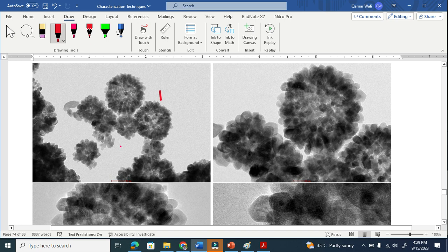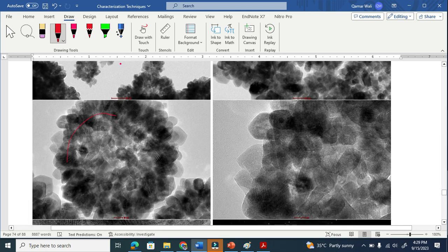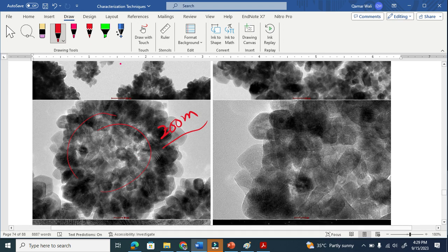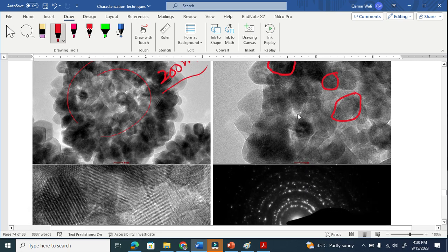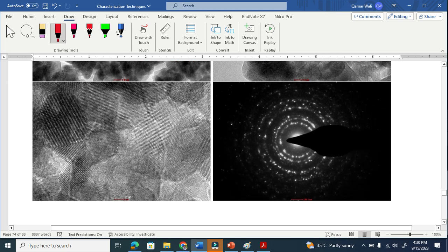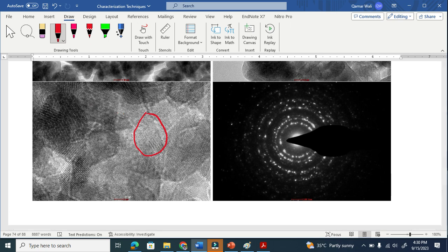This is the TEM image of nanoparticles. This image is basically a low magnification. When we increase the magnification, we get this image here. Further magnification gives us this image here. So magnification basically means zoom — the way we zoom an image or picture with a camera. When we further magnify, we get this shape — this is basically a grain. You can see one grain here, another grain here, and another grain here.